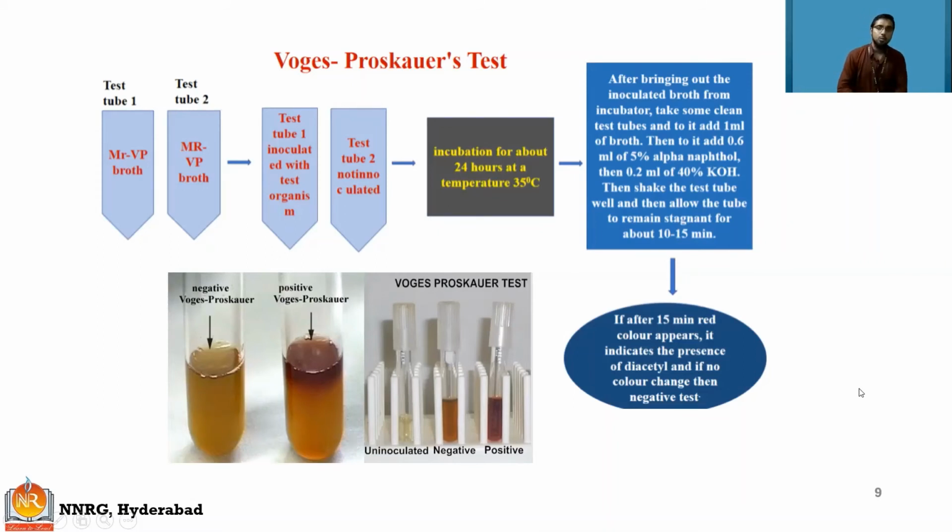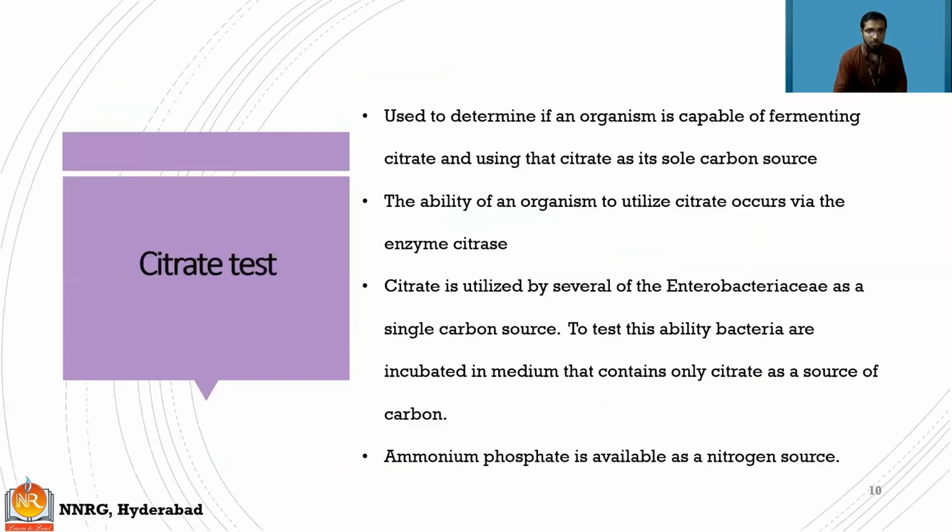The methyl red test was to identify bacteria which are oxidizing glucose molecules and resulting in formation of carboxylic groups on the glucose molecule. So it is basically the bacteria which are causing oxidation of some material in order to form acid, that will be found in the methyl red test. Whereas in the Voges-Proskauer test, the organisms that are able to form non-acidic or neutral molecules will be found. Moving on to the last one, that is the citrate test.